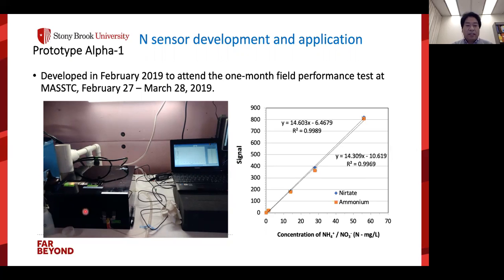That is a small black box, one by one by half foot. I incorporated all the components inside. You can probably see some light here on. These are the pumps, the two peristaltic pumps inside. And you can see some bottles over here. Those are the chemical reagents and the wastewater bottle. The waste bottle collects the waste from the box.